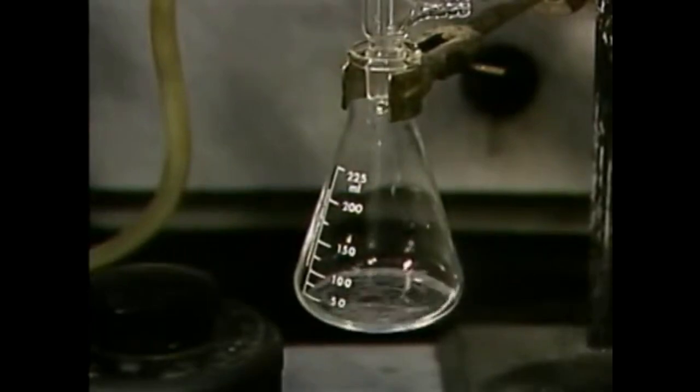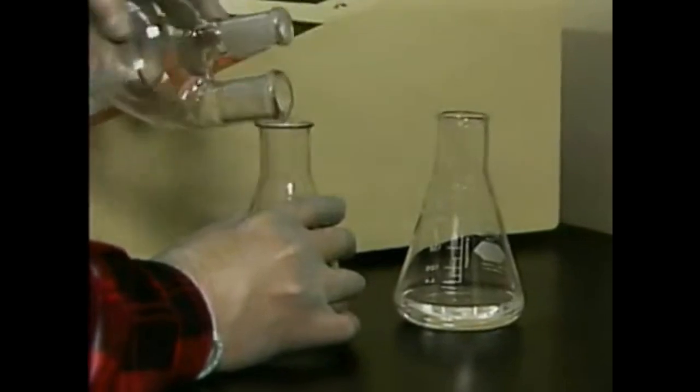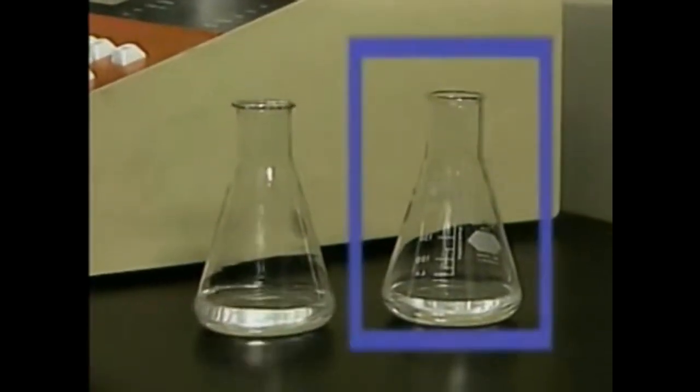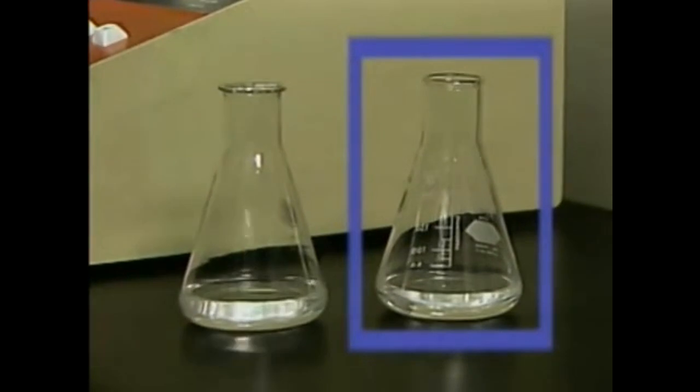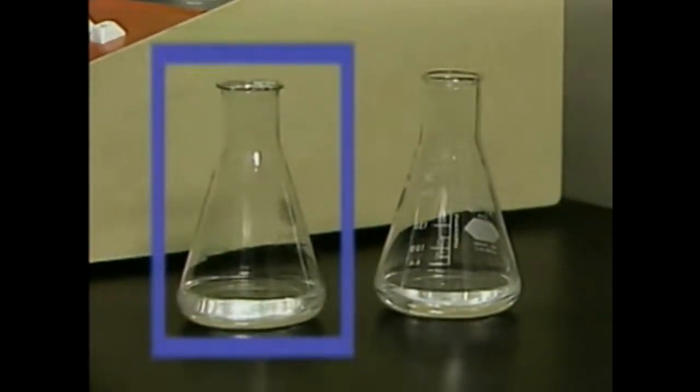As temperature increases and the mixture's initial boiling point is reached, the lighter component starts to boil and vaporize. But because the heavier component has some vapor pressure at this temperature, some of it also vaporizes. The vapors condense in the condenser, and liquid starts to collect in the receiver. When the distillation process is complete, we can analyze the contents of both the receiver and the container. The mixture in the receiver is primarily pentane, but there is some cyclohexane. The mixture in the container, on the other hand, is mostly cyclohexane, with a small amount of pentane.